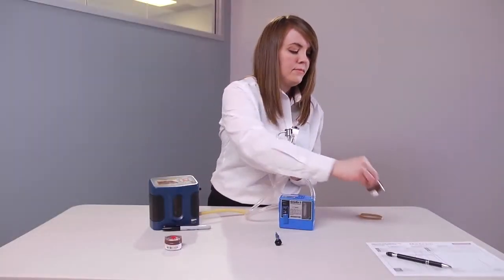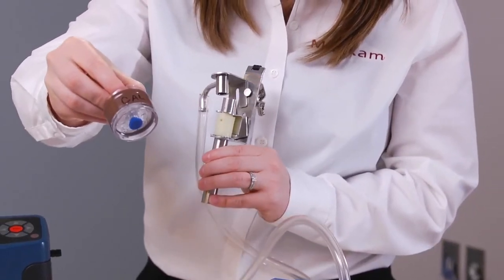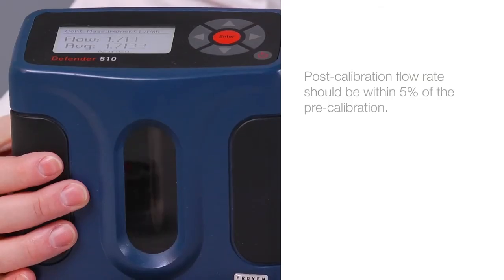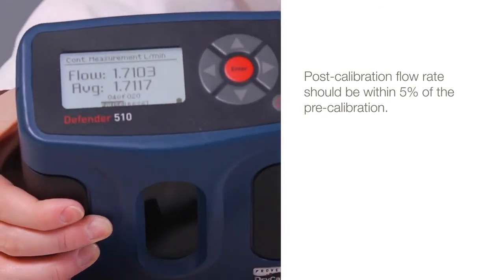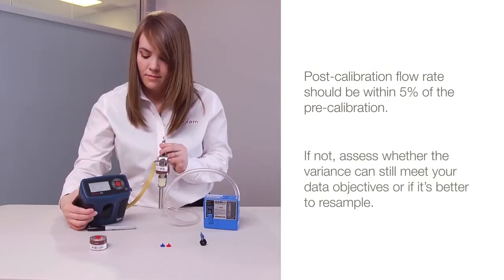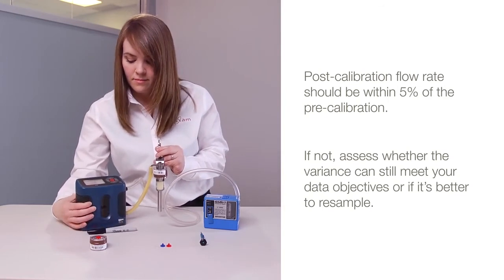To finish, perform a post-calibration using the calibration cassette and repeating the pre-calibration procedure. The post-calibration flow rate should be within 5% of the pre-calibration. If it's not, assess whether the variance can still meet your data objectives or if you should resample.